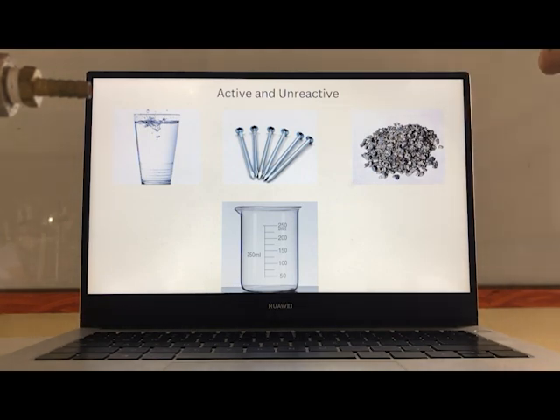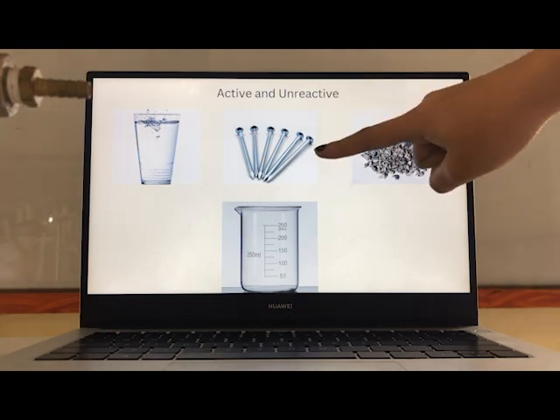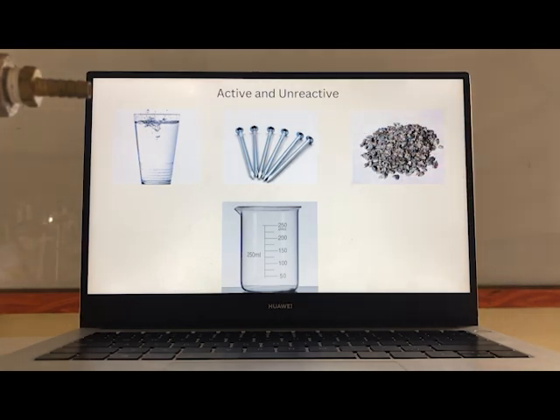Then if we mix it, or soak iron nails here, we have not performed it yet, and I have not tried it, and for our research we also did not find what the result would be. But what we found on YouTube is that if we use litmus paper and soak it in the beaker with distilled water and calcium metal, it will react with the litmus paper and turn into another color. So that is where you can see that the substance we used is active. So that is all. Thank you.